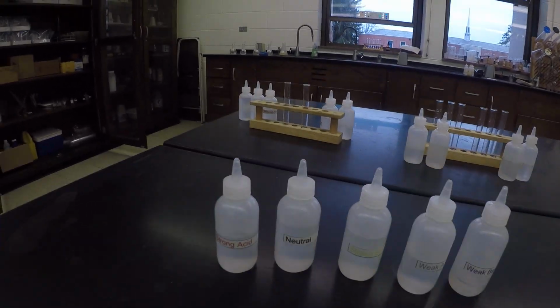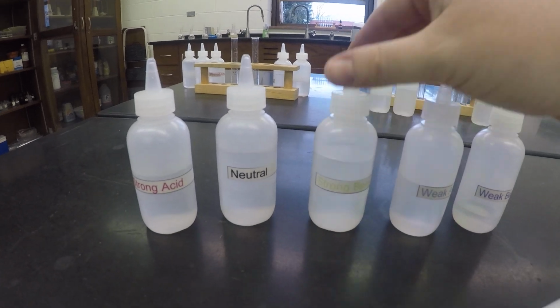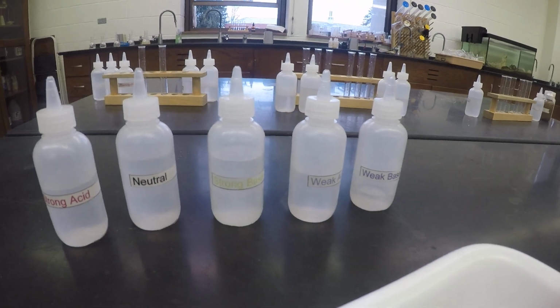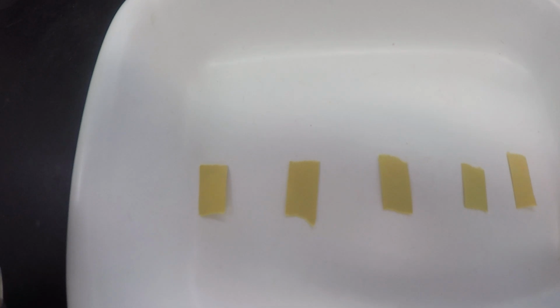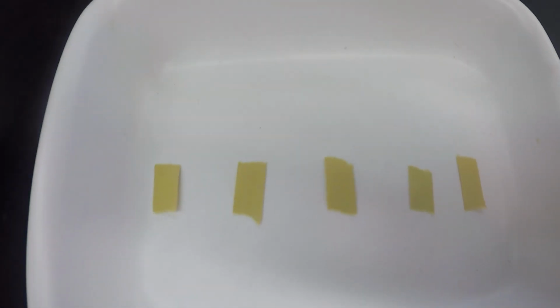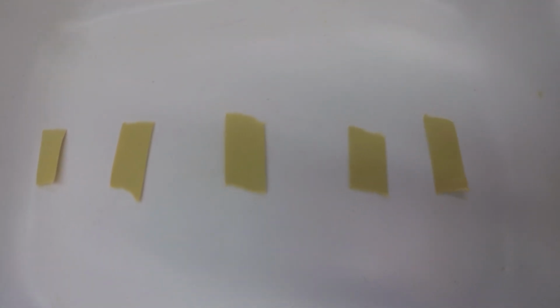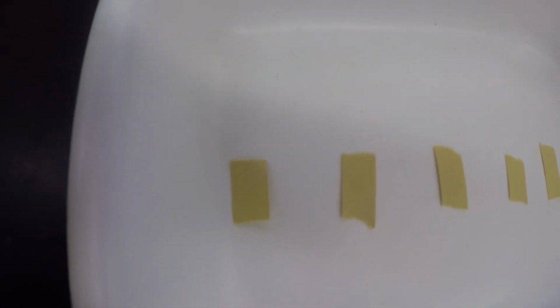So what I have here is some bottles. I've got strong acid, neutral, strong base, weak acid, and weak base. I'm going to take each one of these bottles and put it onto one of these pieces of pH paper. What you need to record on your data table is the color that it turns. That's all we're looking for. The first one, strong acid. All you need to tell me is what color the pH paper turns.